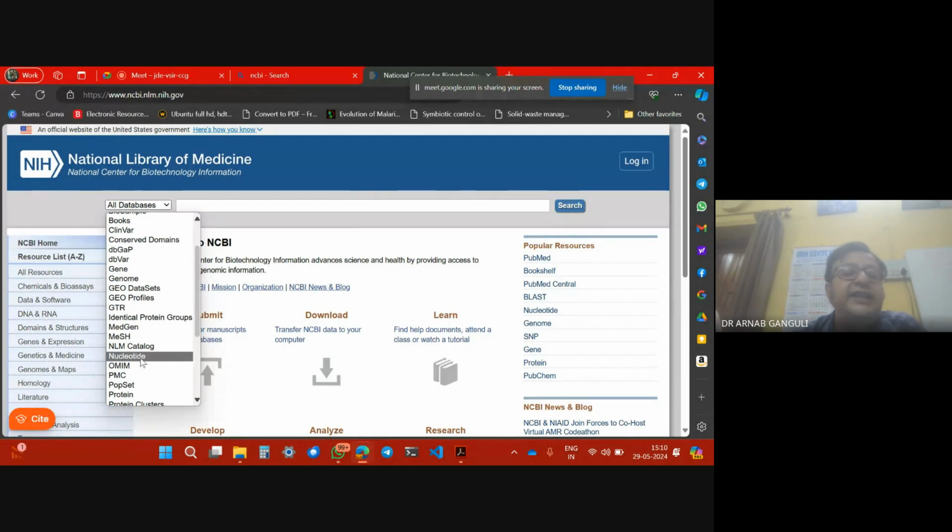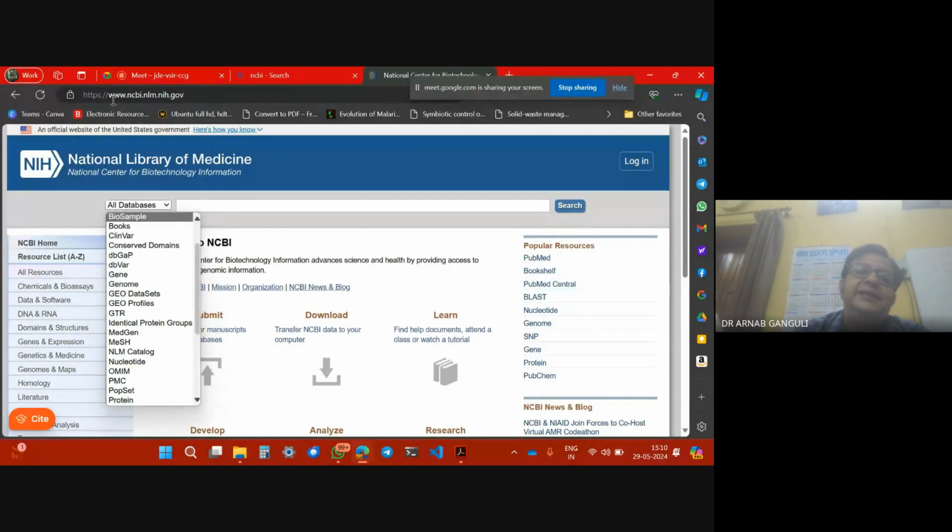But let us talk about retrieving it. Somebody has done the sequencing and now you have to retrieve it back. Sounds tough, I guess, but it is not at all tough. All you need to do is go to this particular website. Your supervisor has told you, retrieve me the 5S E. coli ribosomal DNA sequence. For example, it can tell you even to retrieve a histone sequence, a heat stress transcription factor sequence. All the process is the same. You go in the same manner, and gene after gene, you can retrieve from here.